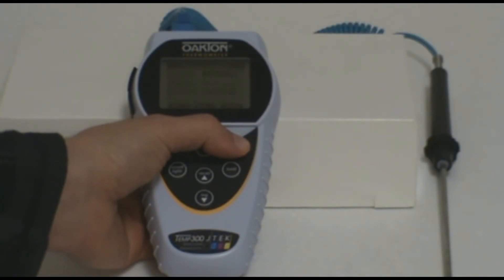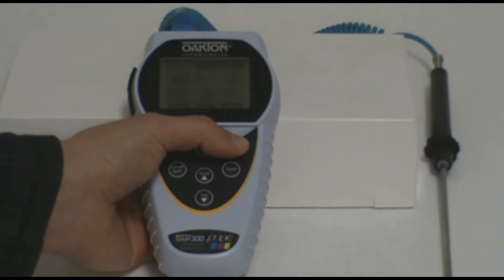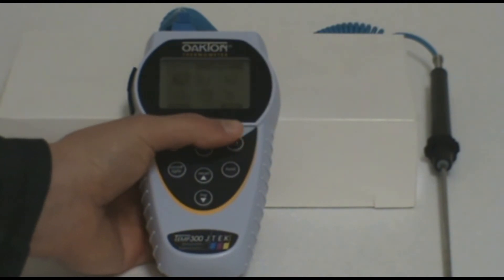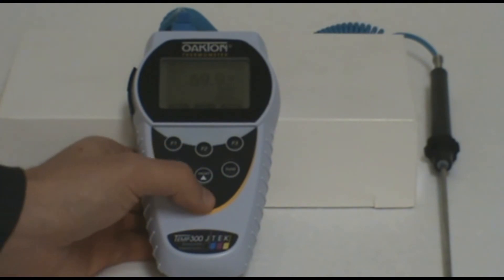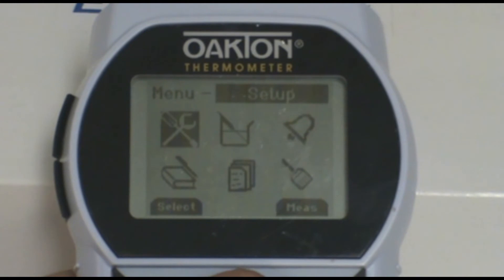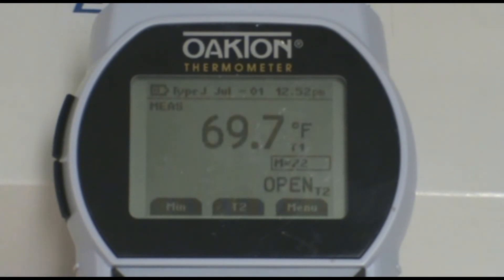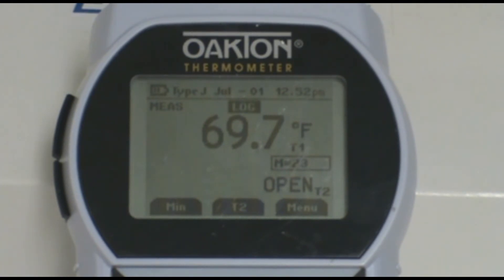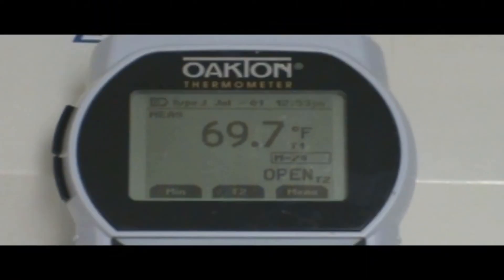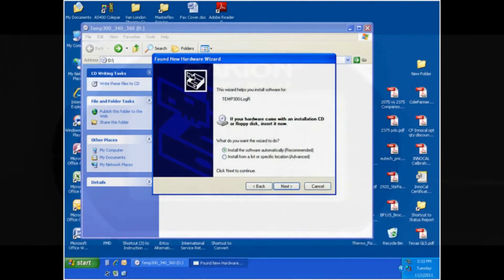Once your setup is complete, press the menu button to exit out of the data logging setup. Then press the measure or F3 button to go back to measurement mode. Once in measurement mode, place your probe in the area you wish to measure, then press the log or down button on the keypad to start data logging. At the top of the screen you will see a log icon that will periodically blink to indicate you are in auto logging mode. To stop auto logging, press the log or down button again.